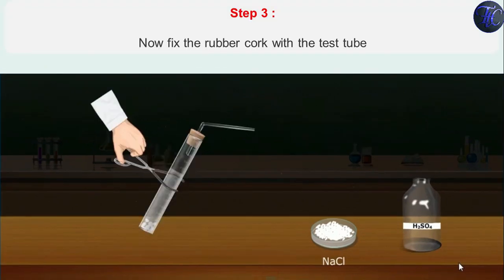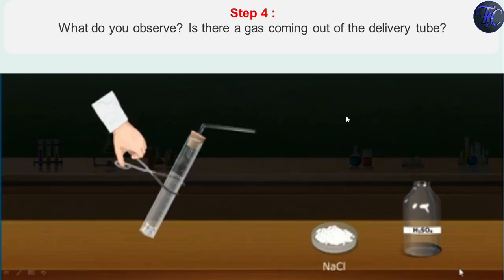Now fix the rubber cork in the test tube. What do you observe? Is there any gas coming out of this test tube? Yes. Here you can see the gas which is coming out of this test tube and that gas is HCl gas.